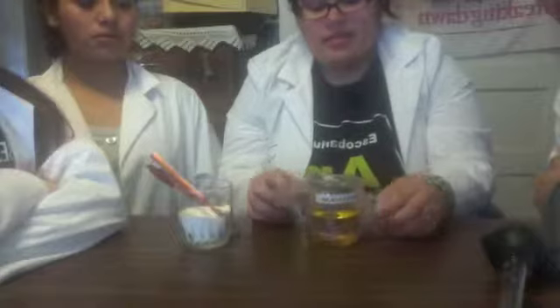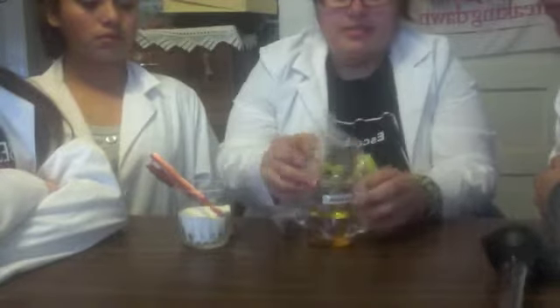After 10 minutes, you will be able to see the separation between the tea and the ethyl acetate, and you will be able to take off just the wrap and put in your sodium sulfate. In order to remove the water molecules from the ethyl acetate, you add 1/16 teaspoon of anhydrous sodium sulfate into the mixture, and that should remove the water molecules.